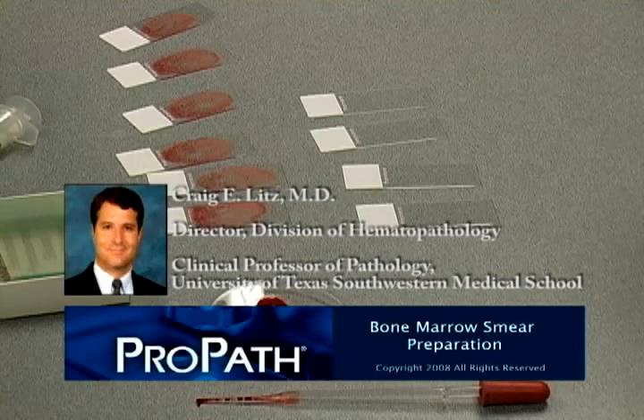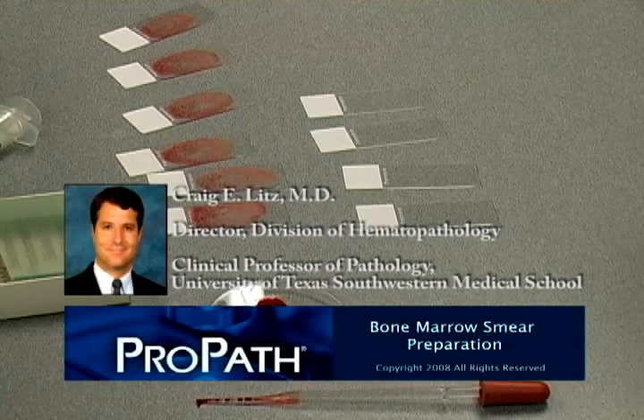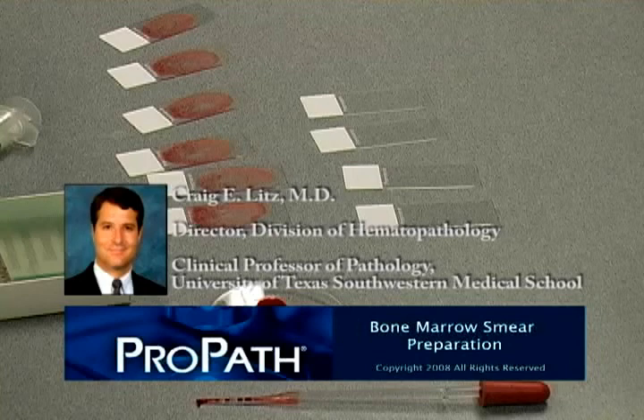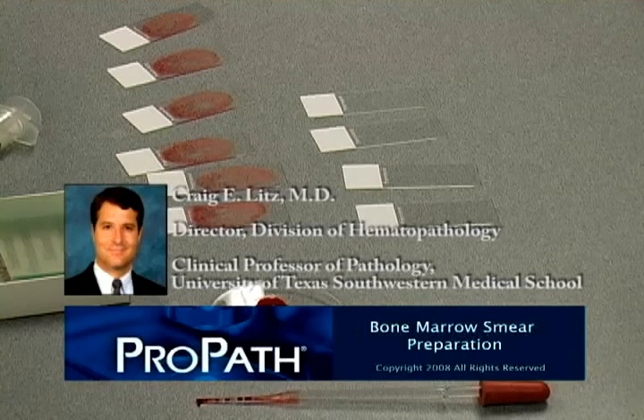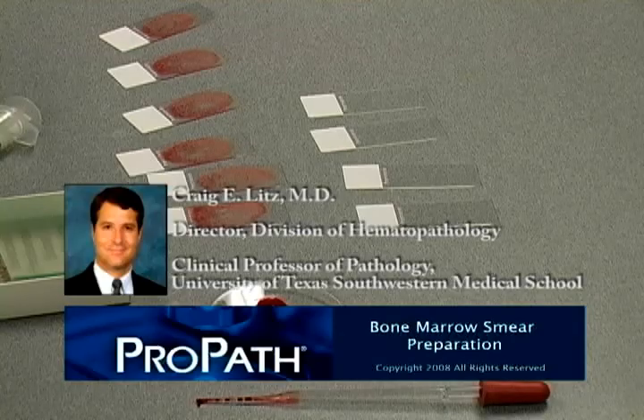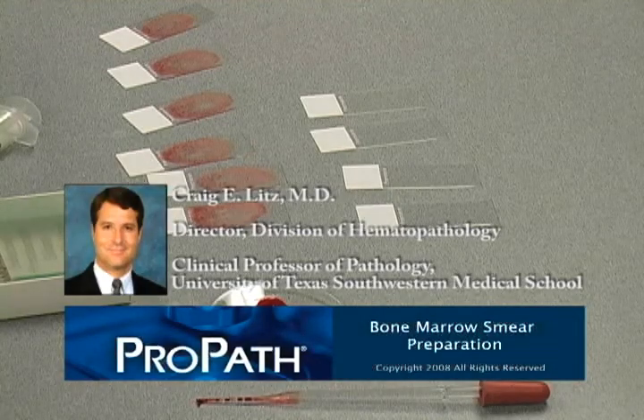The starting material is a fresh, non-anticoagulated marrow aspirate in a syringe. Anticoagulant, especially heparin, can cause severe cell artifact and should always be avoided in the marrow being used for the morphologic exam. Specific anticoagulants, however, are required for separate marrow specimens being submitted for flow cytometry, cytogenetics, and molecular diagnostics.